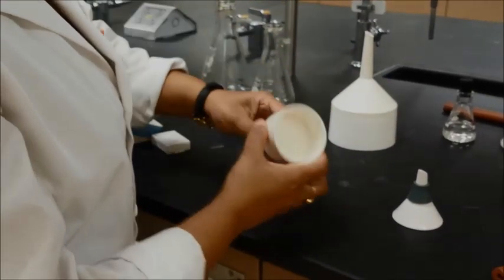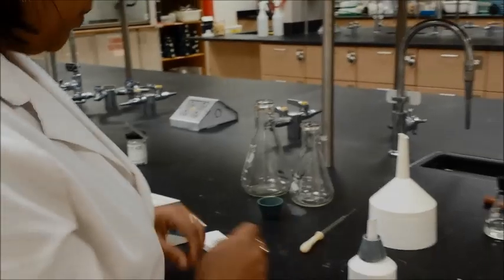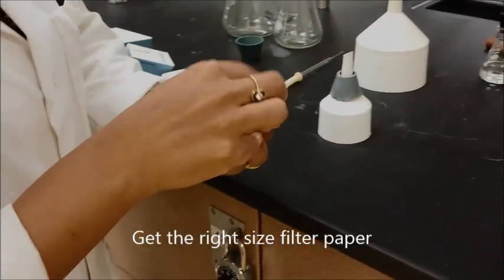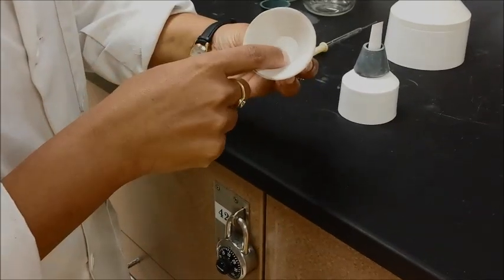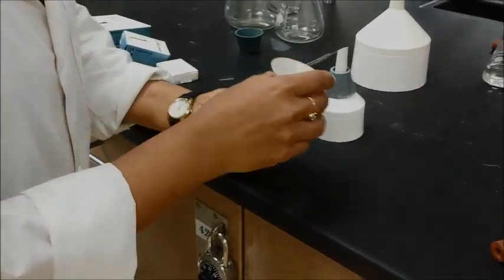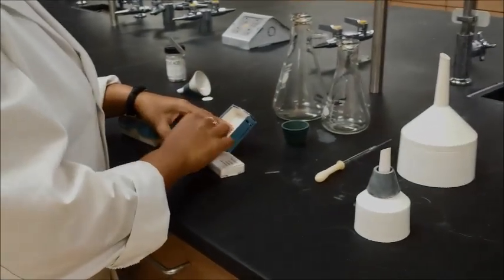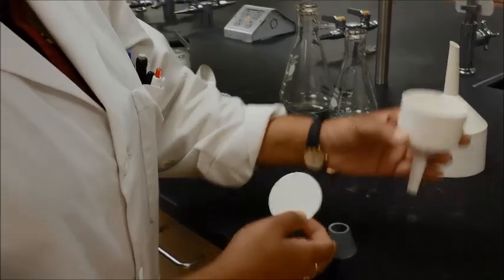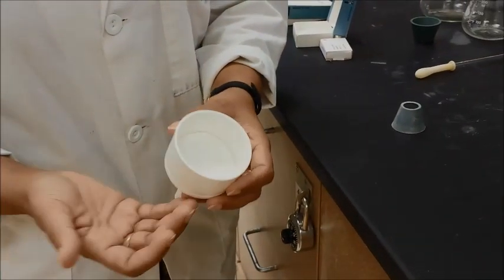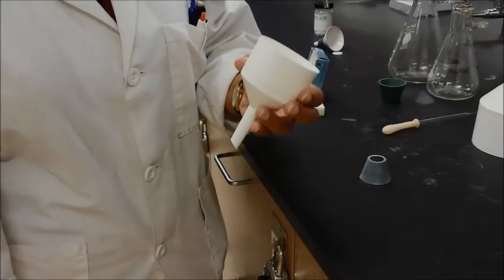The thing about the Buchner funnel that you have to be careful of is you have to choose the right size of the filter paper as well. For example, if you are using a Hirsch funnel, you want to use a filter paper that is the right size for the Hirsch funnel, which covers all the holes in there. It's the same thing when you have a Buchner funnel. You have to get the right size of filter paper that will actually cover all the holes on the Buchner funnel. You should not have any holes exposed, otherwise your sample will get pulled through.